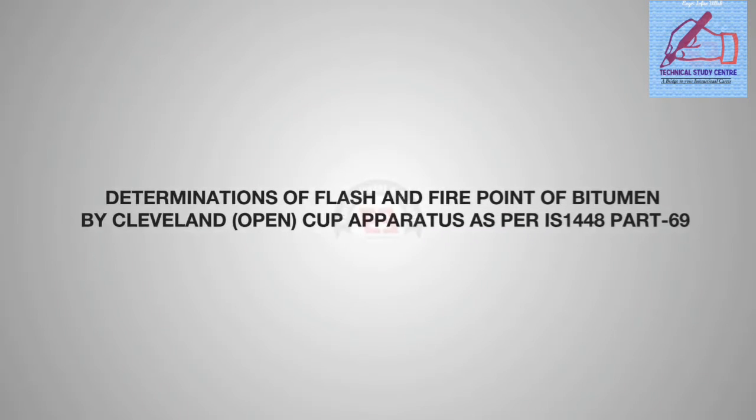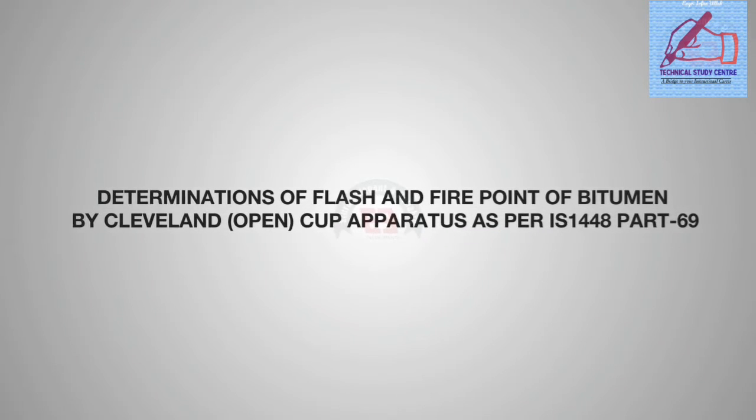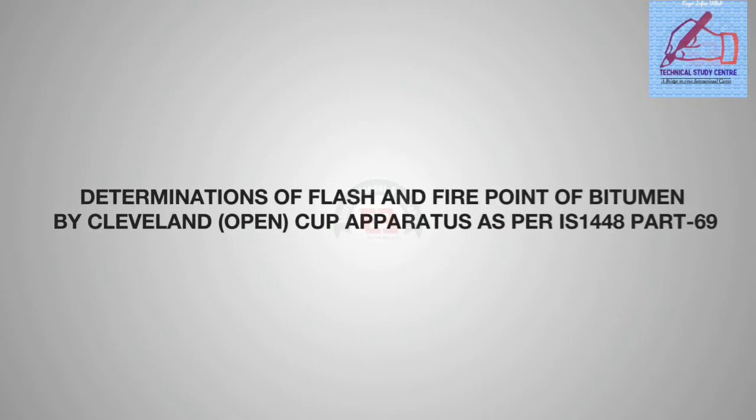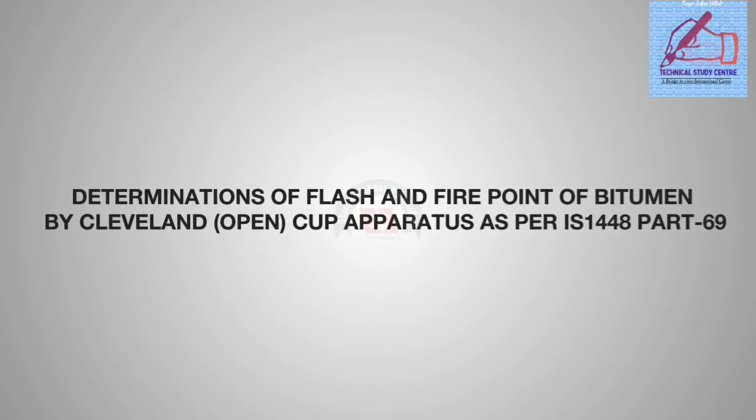Determinations of flash and fire point of bitumen by Cleveland open cup apparatus as per IS 1448 Part 69.